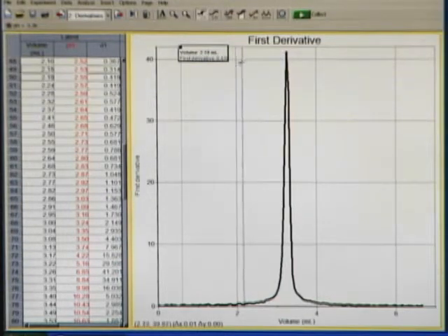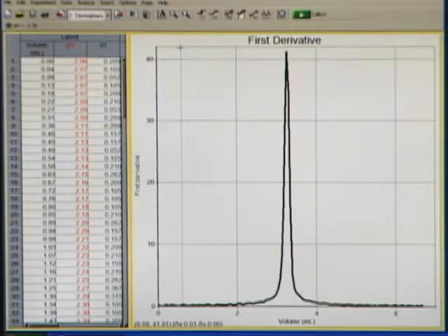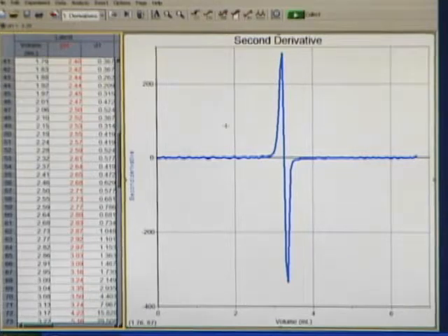Even better than first derivative, though, is second derivative. So I'm going to close out this first derivative, go to the Next Page button again, and here's our second derivative.